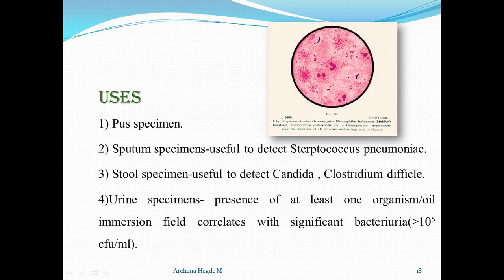Coming to the image here, you can see both gram positive and gram negative. Gram positive takes blue color, here cocci are seen. These two are in chain, this is in pair, and this is a single colony. Whereas gram negative, both cocci can be seen or bacilli can be seen, which are rod shaped, and cocci are round shaped. Here these are bacilli.